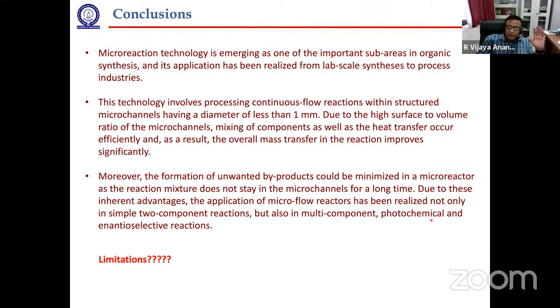But is there any limitation of this particular method? I would say yes, because only homogeneous reactions, where the reactants are soluble in the solvent, can be done in a microreactor.